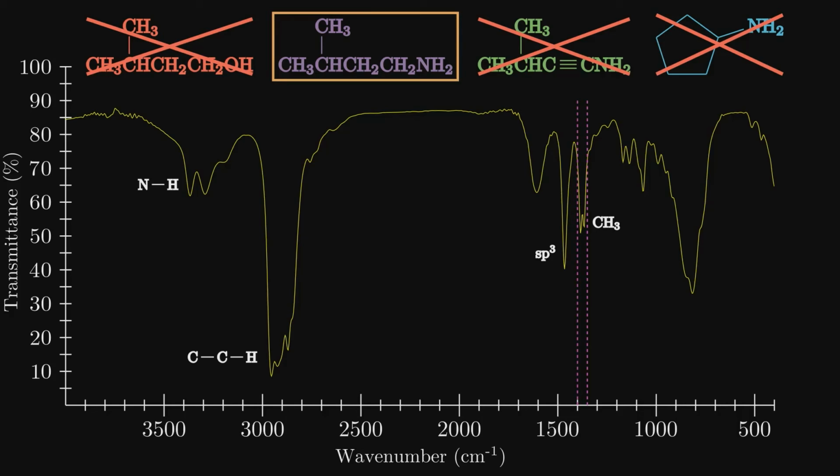We know the compound, but the reason I chose this example was the peak around 1600. This also represents the nitrogen-hydrogen bond. Where the one around 3400 was a stretching vibration, this is caused by bending. Notice it is broader and more intense than the carbon-carbon double bond that was there in the third practice. The reason for this is the nitrogen-hydrogen bond is more polar and due to the effects of hydrogen bonding.